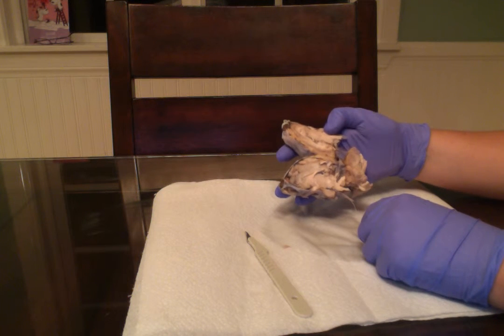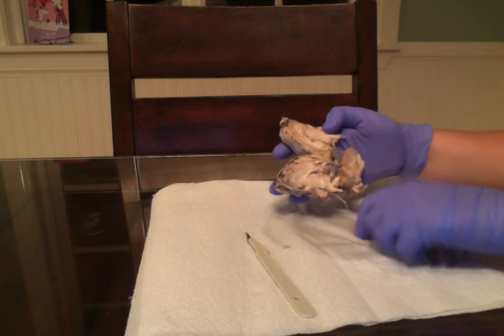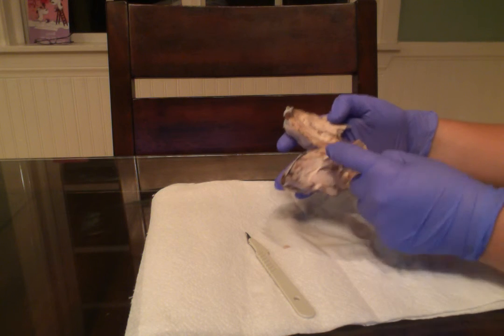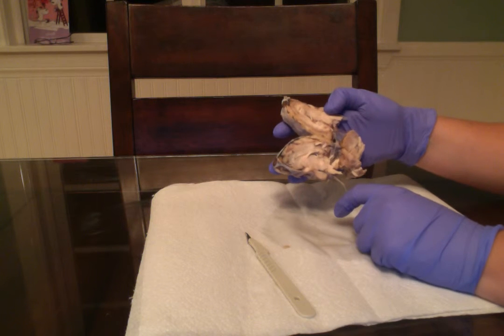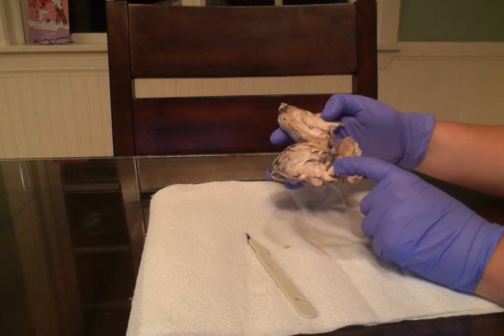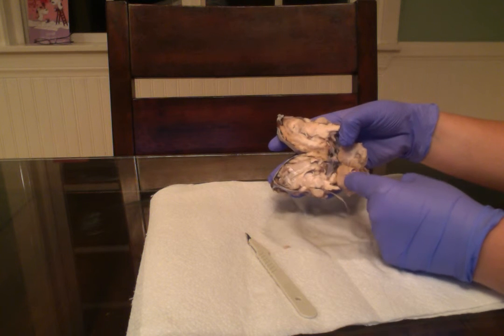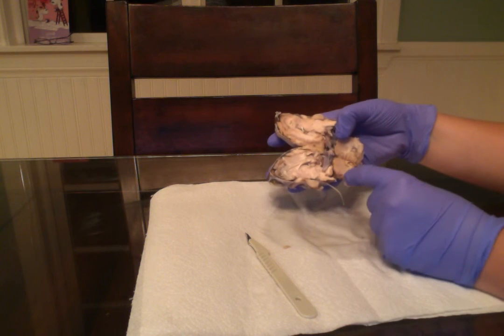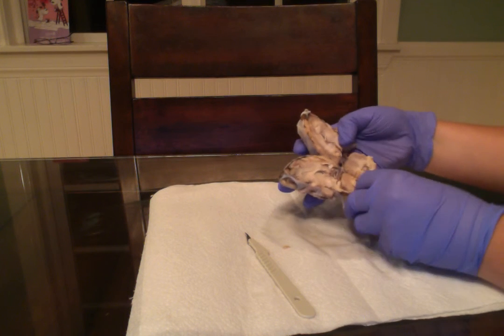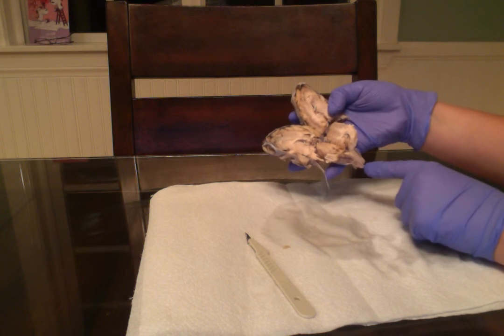After that, we have the intermediate mass of thalamus. And that is going to be right here, that meaty area. Then we have the cerebral peduncle. And that one is here. Then followed by the pons, and our pons is going to be here. We also have our medulla oblongata down here.